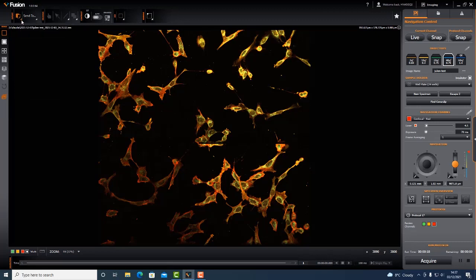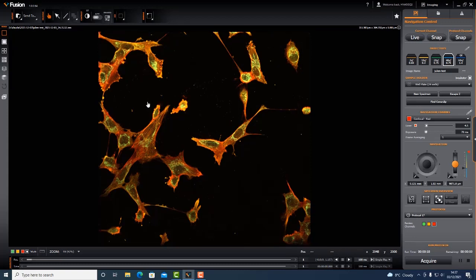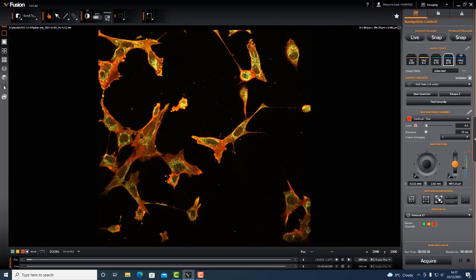And then across the top here I can choose, for example, to export my current image, so it's like a screen grab effectively. I can export it to the clipboard or export it to a file. I have a range of tools up here. If I have display all, these tools are grayed out, I can't use them. But if I remove the display all, I have my finger, which allows me to go back to zooming in and out. If I zoom in, I can pan around. Let's just reset that.